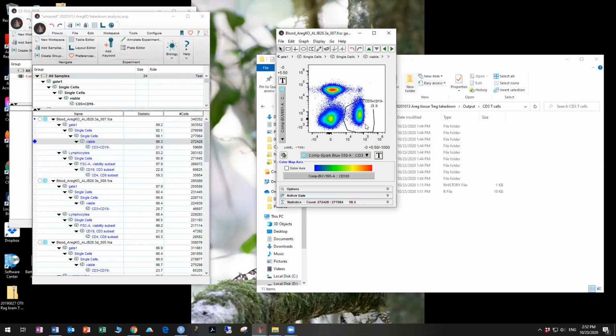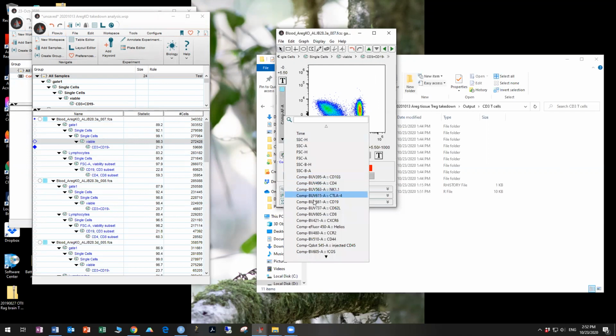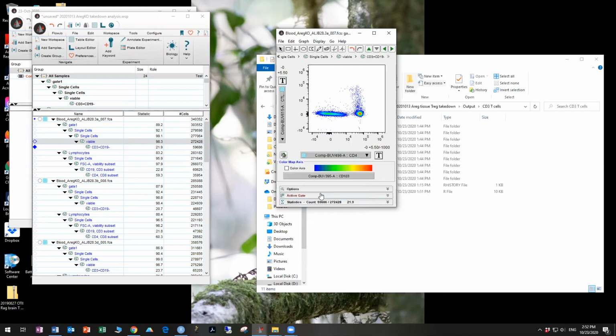And so you may want to have your analysis in FlowJo open so that you can see what each parameter looks like. So for instance, if we had our CD4 and we were going to have one of our difficult markers, say CTLA4 open, you can see this is what the CTLA4 looks like when we assess it here in FlowJo with the bi-exponential transform set more or less appropriately. You can see that there's a bit large negative population and then this plume here, which would be our Treg population. And there's not a big spreading.